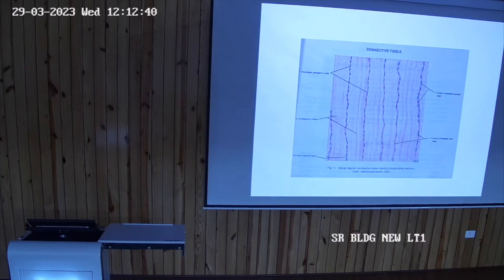No doubt, multiple nuclei, flattened nuclei on the periphery. Pink color fibers you will see of collagen fibers, and muscle fibers are looking the same. The only difference remaining is that in skeletal muscle you will see the transverse striations, which are not seen here. Because of that I am showing you this slide.